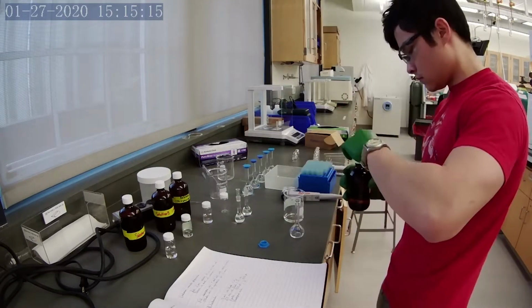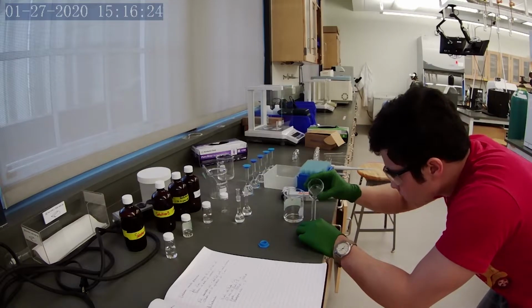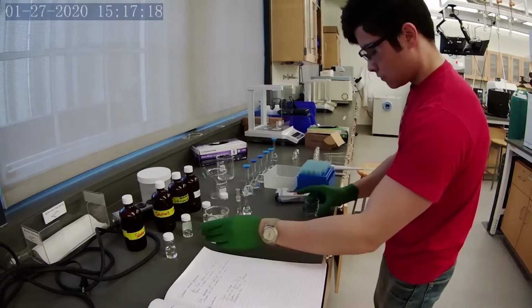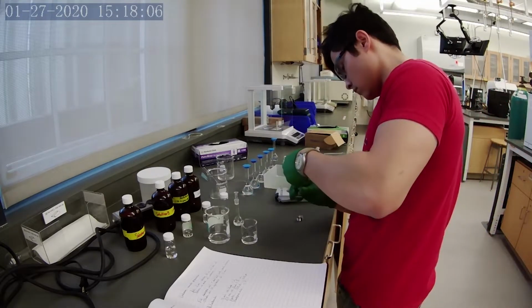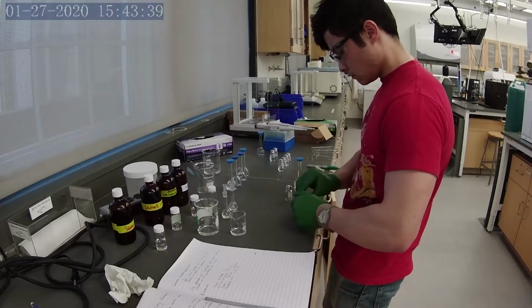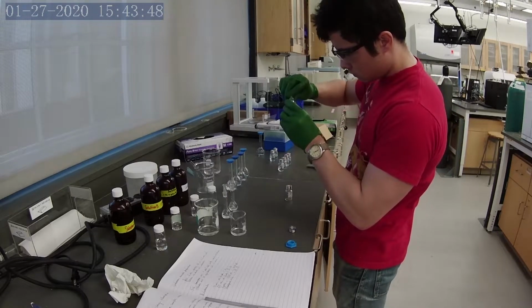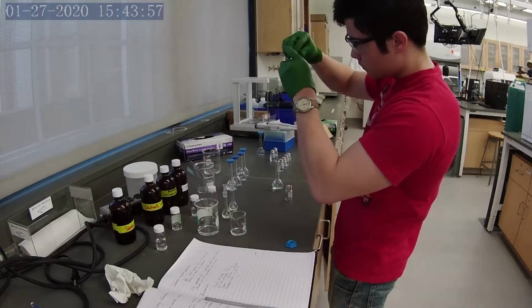The error associated with the 25 mL volumetric flasks is plus or minus 0.06 milliliters. And for the pipette, it's plus or minus 8 microliters, so you can use those numbers to propagate the error for your analyses, since we're not doing replicates. For the reference solutions, the 10 milliliter volumetrics, I didn't catch the error for them, but they're not quantitative, so... And again, I'm only filling these headspace vials about halfway so that I have enough room to sample the headspace above the solution.